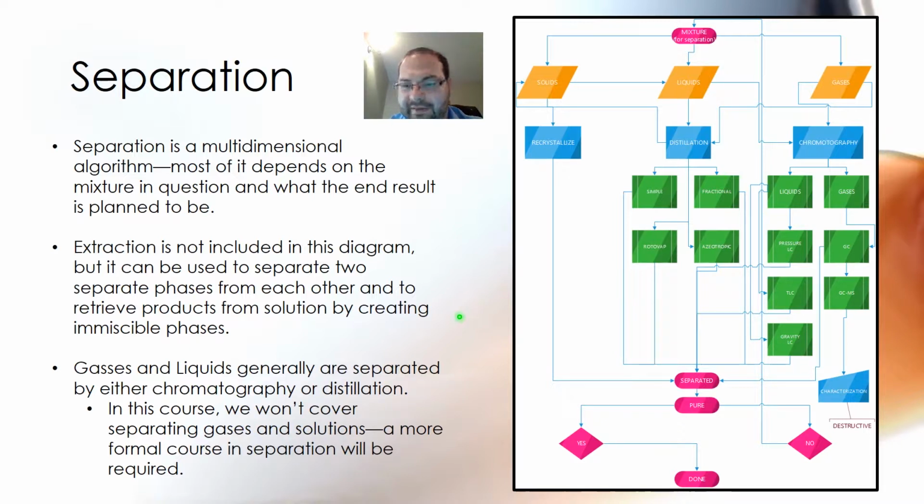When we do TLC, you'll see what we're talking about with that, but it's a method of really helping see what will separate something in another chromatography setup, or you can use it to retrieve small amounts of compounds because you can retrieve them from the plate and then redissolve them and collect them. That's actually a lot more work than it's worth sometimes.